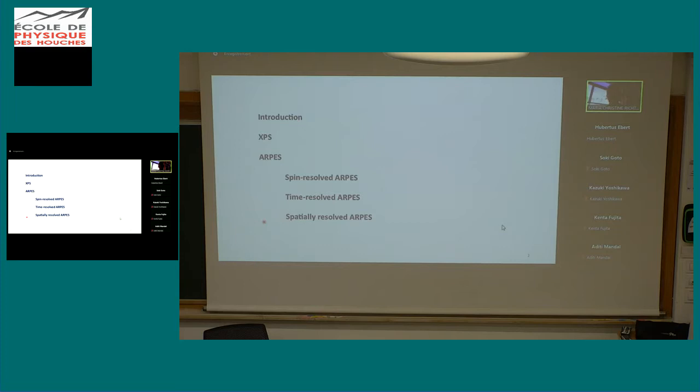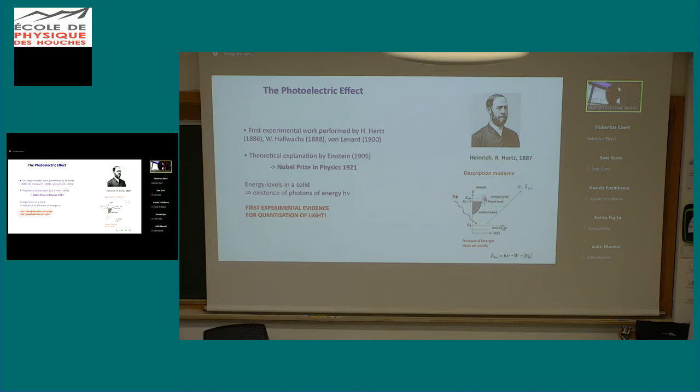So my summary is really quite simple. I will talk about photoemission, XPS, and then different types of photoemission. So, of course, we have to do some historical introduction.